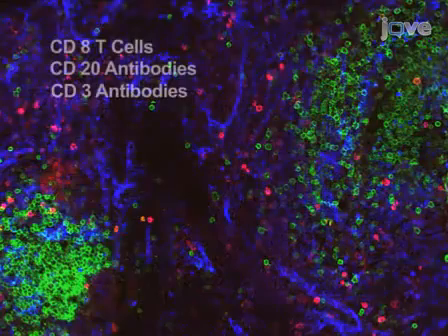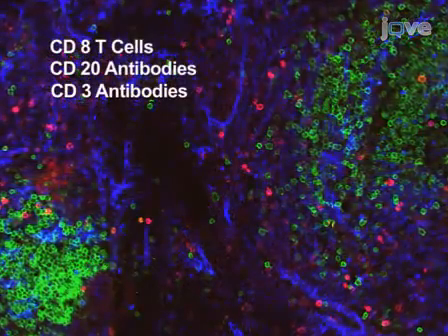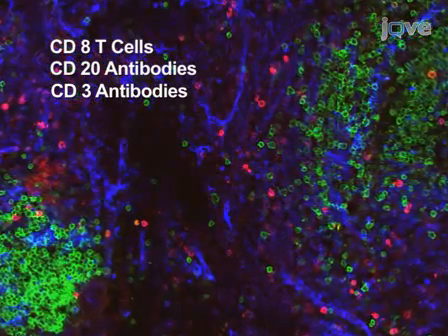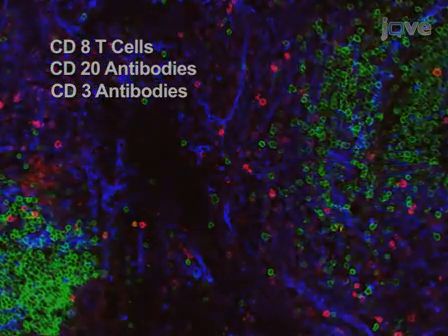In addition to using in situ tetramer staining combined with in situ hybridization, as we're demonstrating today, we also routinely use in situ tetramer staining combined with immunohistochemistry to determine the location, abundance, and protein expression profile of antigen-specific CD8 T cells in situ.